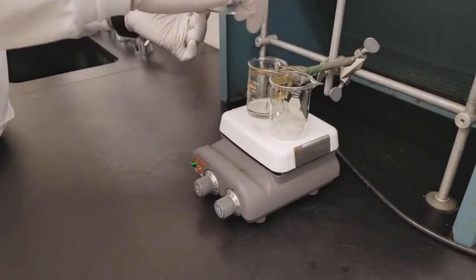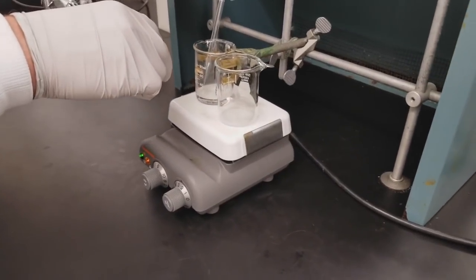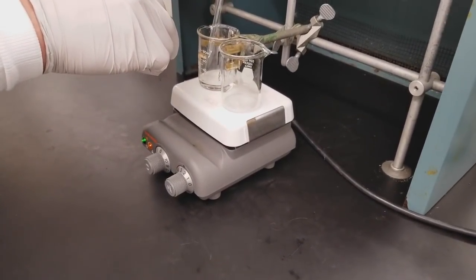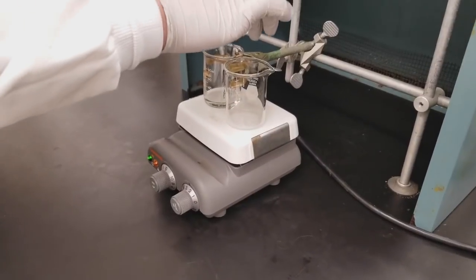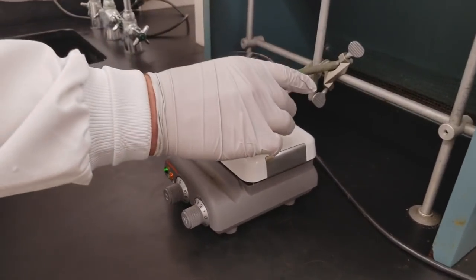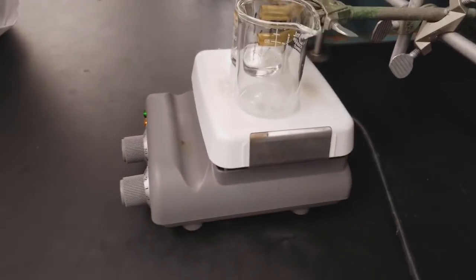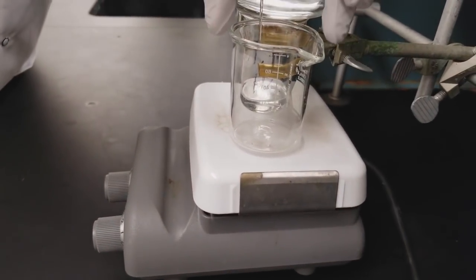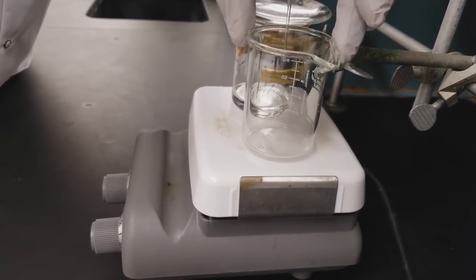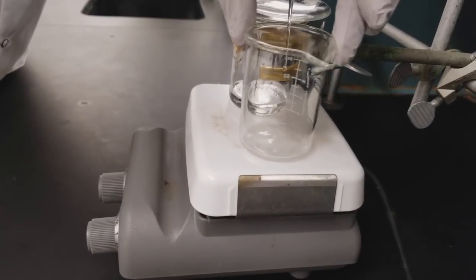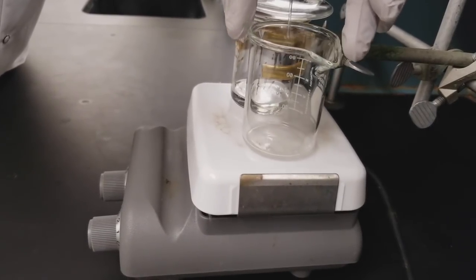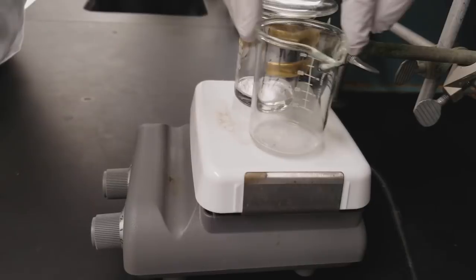We're going to want to swirl the beaker as we add additional hot solvent. So we're just taking up some more ethanol and then adding it to our beaker in a drop wise slow fashion. Continue to swirl the flask and look for all of our solid to dissolve.